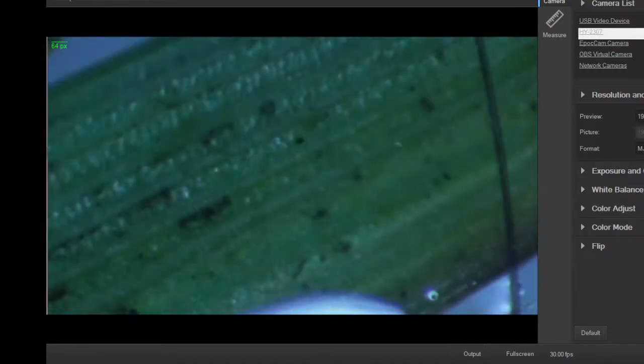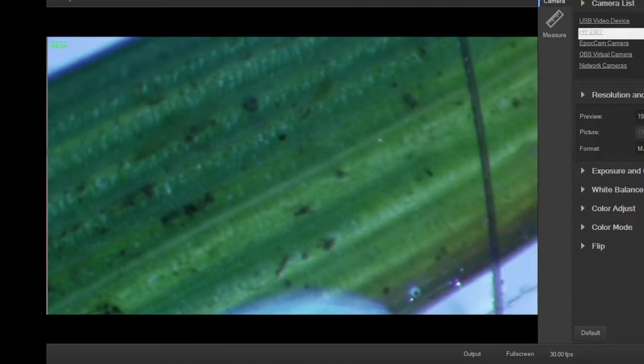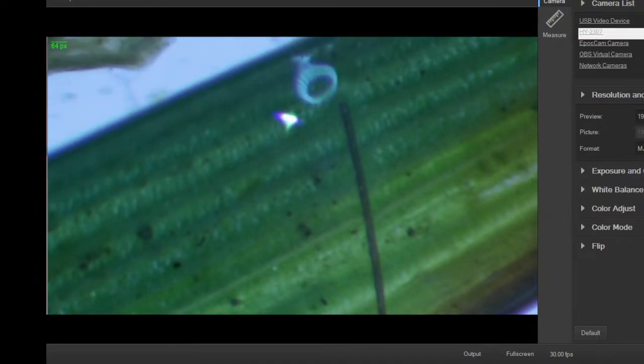If I can get more light in here or not, let's see. There's a backlight. I can add a little more backlight to it. That helps somewhat.